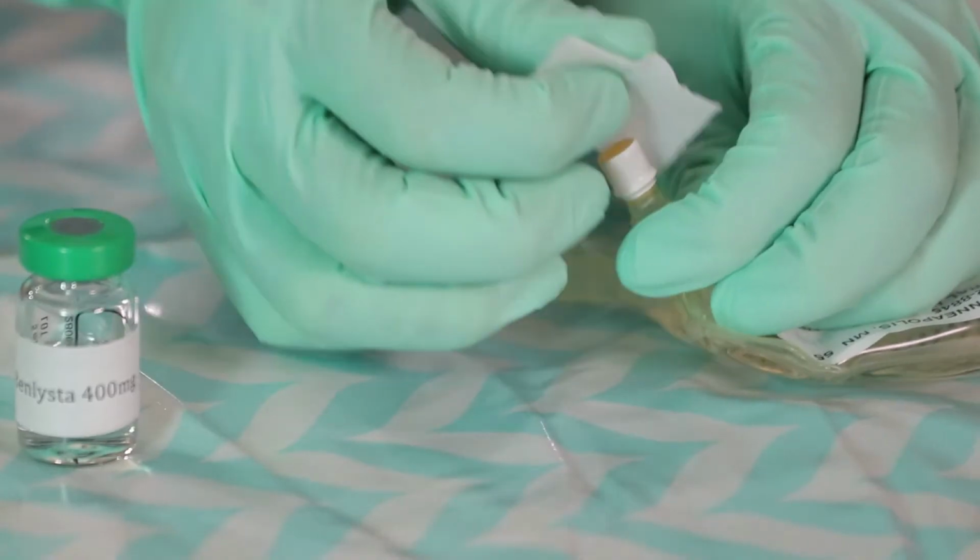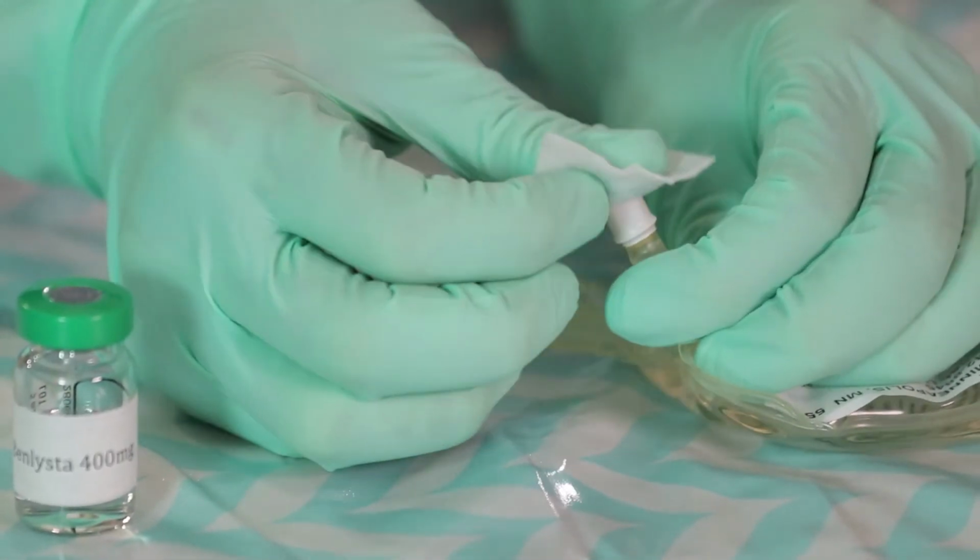Once the medication is in final solution, re-swab the tops of the vials using 10 long, firm strokes or at least 15 seconds. Remember to remove the alcohol swab from the top of the vial and allow it to dry thoroughly before accessing. Also be sure to swab the port of the bag. Draw up the final dose using proper aseptic technique.